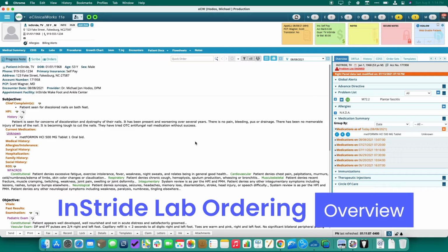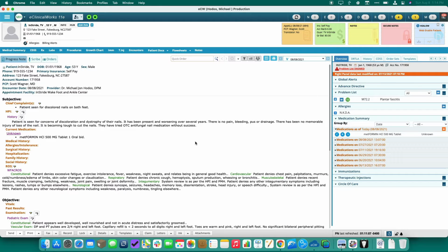We've developed this workflow so everyone can submit their specimens in the same way, streamlining the way it works, minimizing the amount of information that needs to be taken out of ECW, keeping everything in to limit printing, scanning, filing, etc. In order to order your fungal stain specimens, your PCR specimens, or any other pathology specimens, we need to order them. It's done similarly for each of those types of specimens, and we'll take a look at each of them.